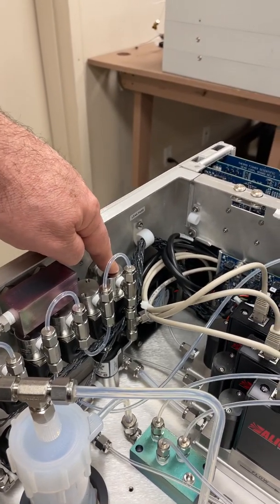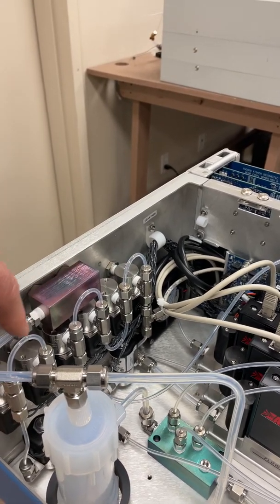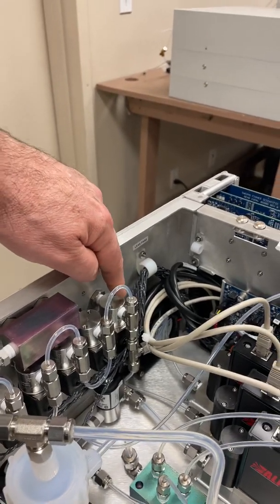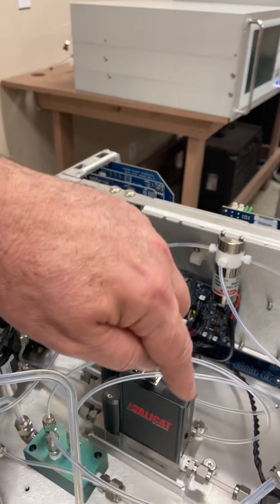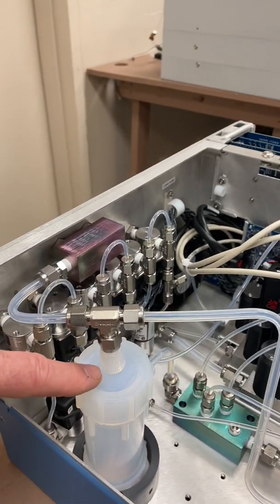For example, SO2 on this solenoid, H2S on this solenoid, or methane, CO, CO2, ammonia — whatever you need. So as you take SO2 from a solenoid, you can mix it through one of the flow controllers at a known flow rate, mixing with the dilution air at a known flow rate into this chamber, and then output the concentration to your analyzer.